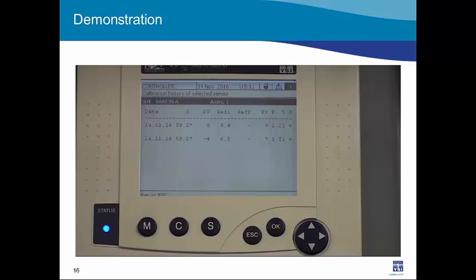So actually, minus 4 millivolts is pretty close. A perfect drift voltage would be 0, meaning that everything is ideal and perfect from the time you did the electrode zeroing to the time you did the subsequent matrix adjustment. And then it lists all the additional information there: the new reference concentration, potassium, procedure, temperature, and so on.